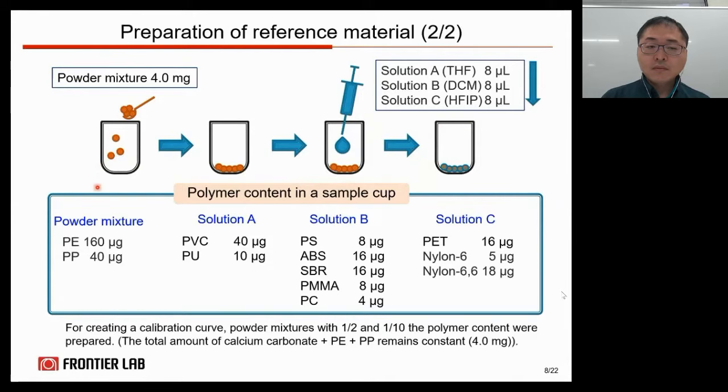The content of each polymer in the sample cup is shown here. Since it was needed to prepare a calibration curve for quantitative analysis, we also prepared samples with 1/2 and 1/10 of this polymer content.